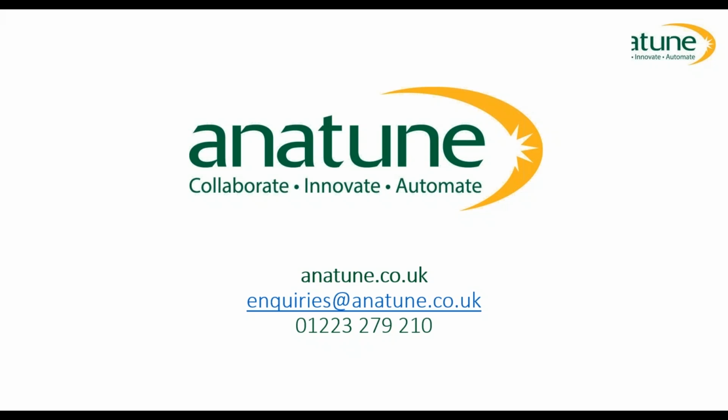Excellent. Do you have any thoughts on how to validate analysis that involves a more traditional SIFT-MS usage, that is, for example, continuous analysis rather than automated analysis? Yeah, I think the first validation exercise with the formaldehyde is closer to what would be classed as traditional SIFT-MS, because in that method, you're basically analysing direct gas phase in a bag. So that's much closer to what would traditionally be done with SIFT-MS, where you're looking just to analyse the gas phase around you. As you say, the second version is much more of an automated analytical method. So yeah, I think you could.